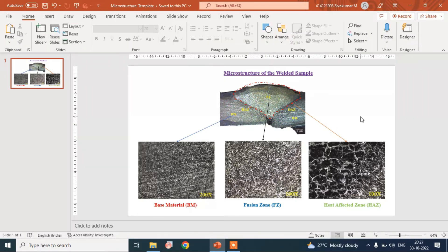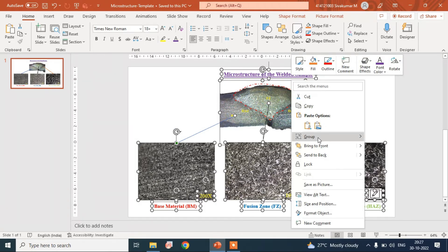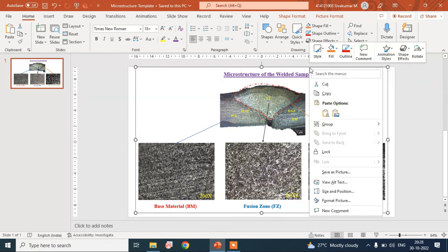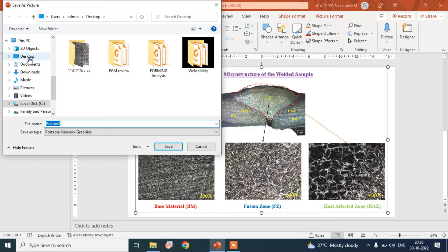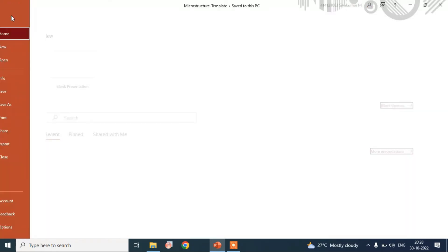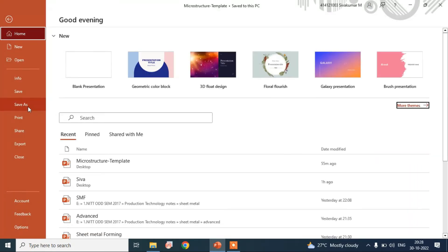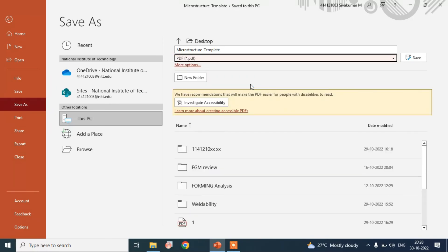Now everything is done and all the parts are separated. We convert them into a single picture — select all, then right-click, then group. Then right-click and save as a picture, or save the picture as a PDF format, which is good for taking a printout.